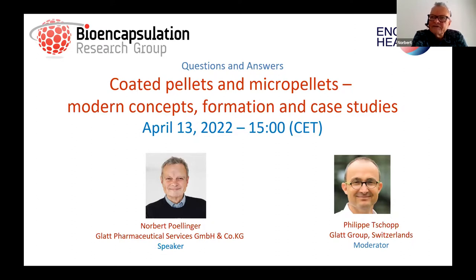You might have a fluid bed unit in your plant available, and you just switch from the Wurster configuration to the micropicks configuration, just switching from one insert to the other. So thanks a lot. So you see it more as more drug product options via the direct pelletization rather than high throughputs only, right? Absolutely.